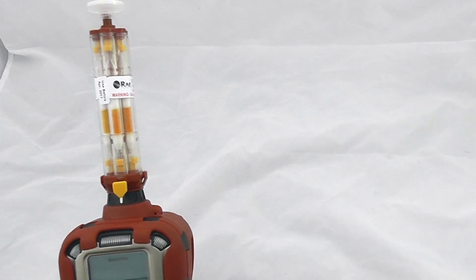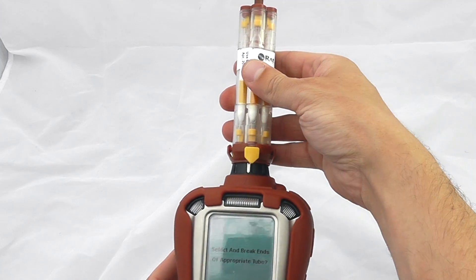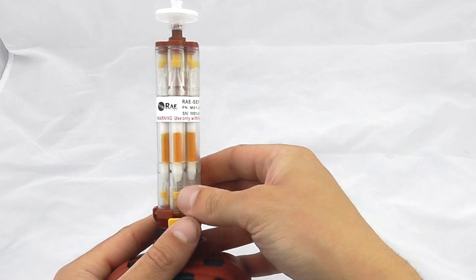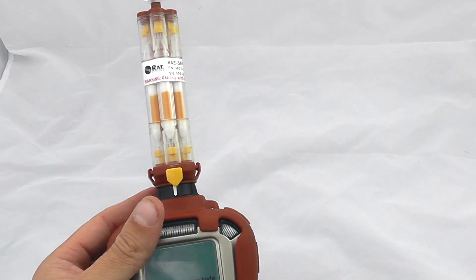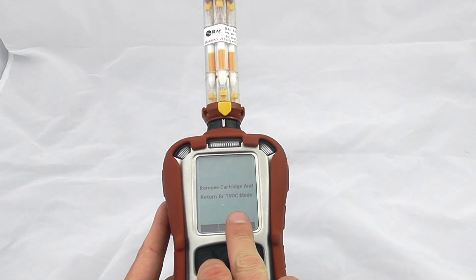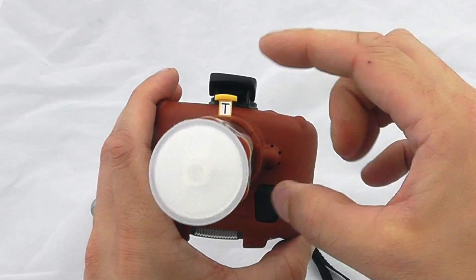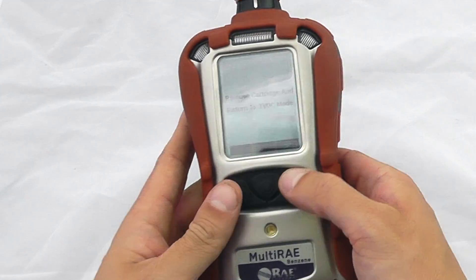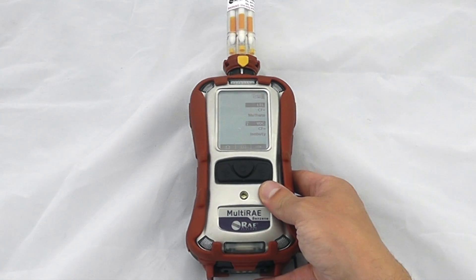You can now continue to run an additional test — scroll across once and then scroll across again to the next tube, snap the ends again and perform an additional test — or we can abort, and it will say remove the cartridge and return to TVOC mode. To flick it back into TVOC mode, switch back to T, and we're now in total volatile organics and broad-spectrum TVOC measurement once again.